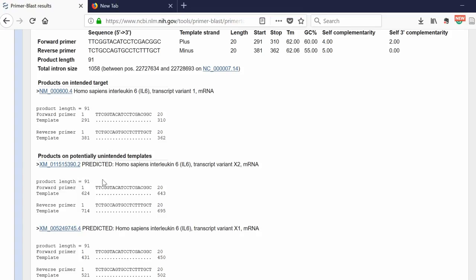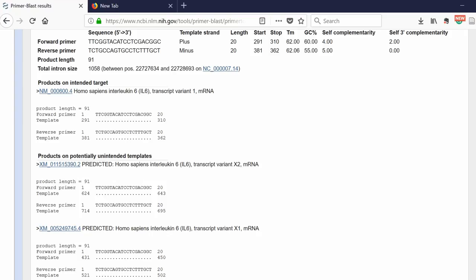It's saying that those primers could potentially bind to Homo sapiens interleukin 6 transcript variant 2 and also variant 1, giving you the product length, which is exactly the same product length as what we have for our variant. Now this isn't an issue in this scenario because I'm not interested in different transcript variants. But if you were interested in amplifying a certain variant over another variant, you have to be careful here because obviously it could amplify different variants.